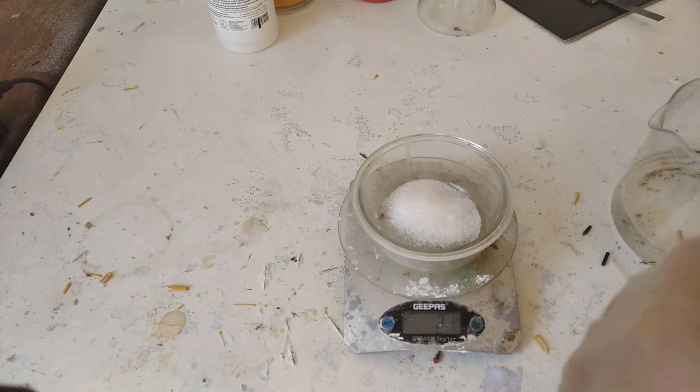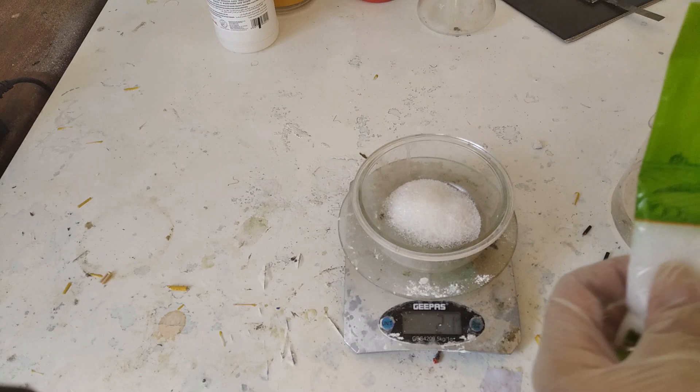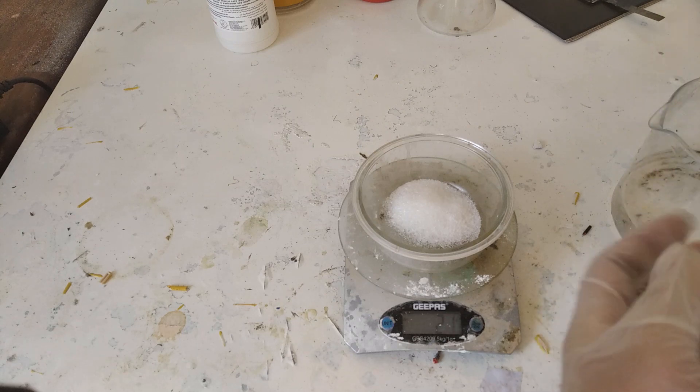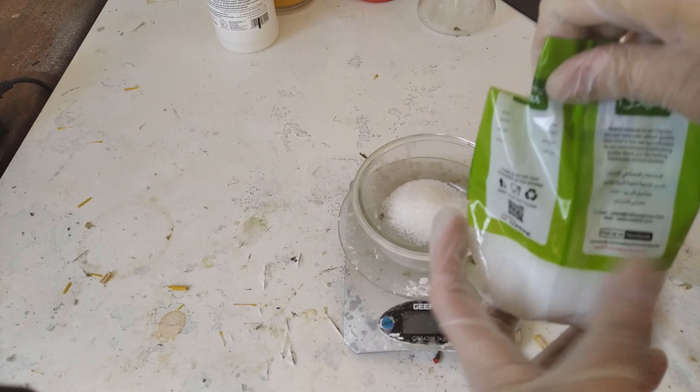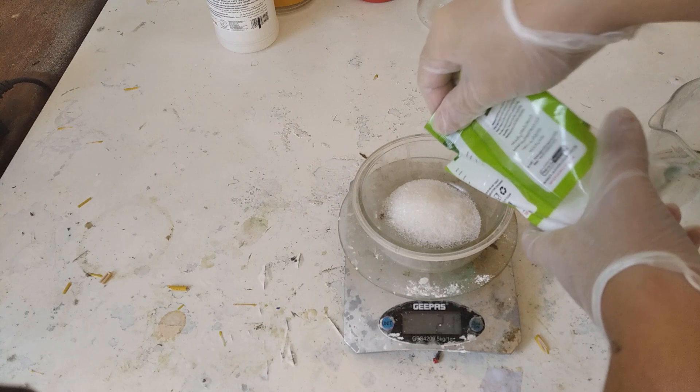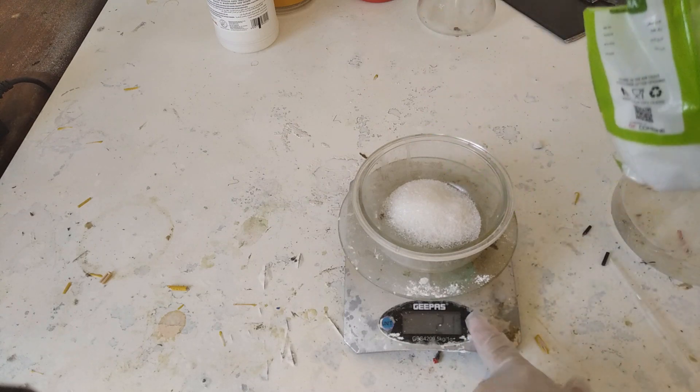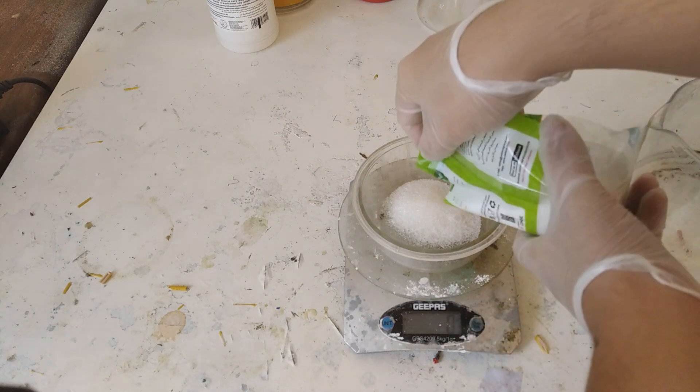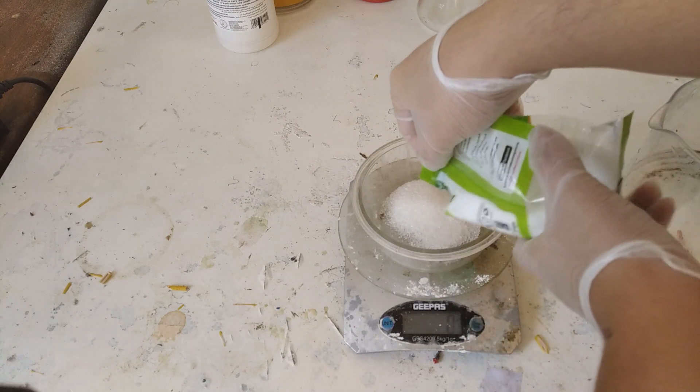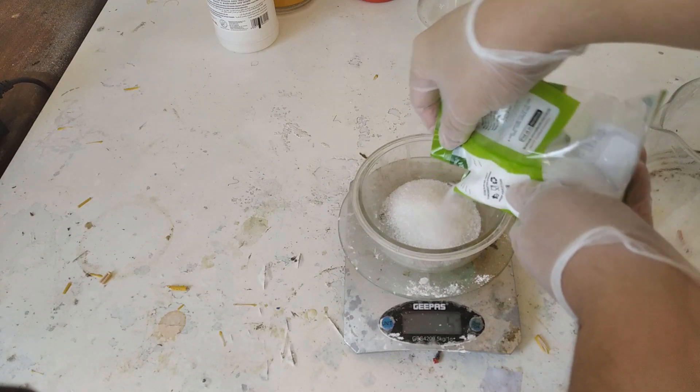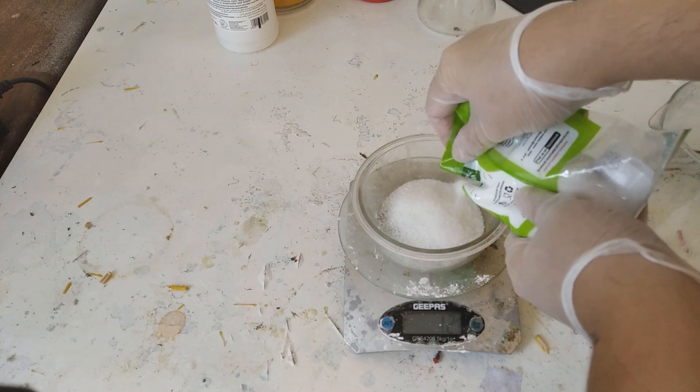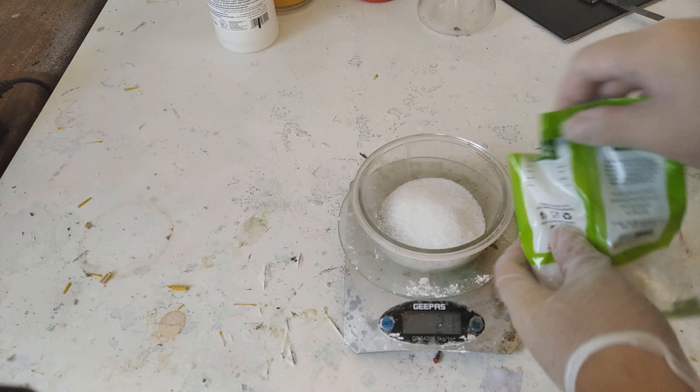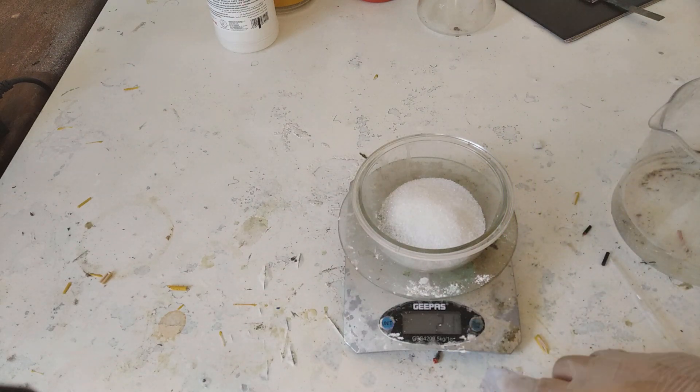So I'm going to grab here citric acid and we'll just put about the same amount. Reset this. Yes. Come on. Right. So we basically have a 1 to 1 ratio.